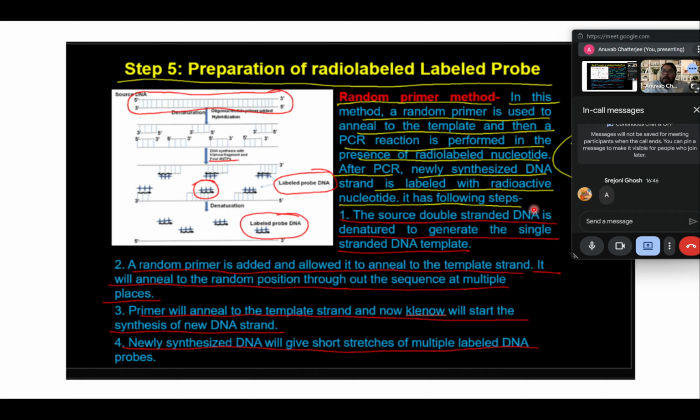You just start with RNA instead, and you make a cDNA out of it, and then you detect the cDNA in the gel. For detection of the DNA or RNA molecules, the easiest thing to use is a complementary strand of DNA. So you essentially make the complementary strand and let it base pair to the DNA or RNA of interest on a gel or anything else. And then due to some properties of the particular probe, you can detect it.